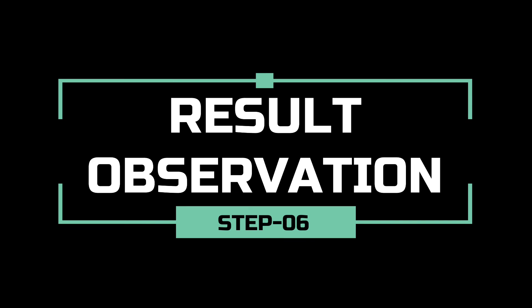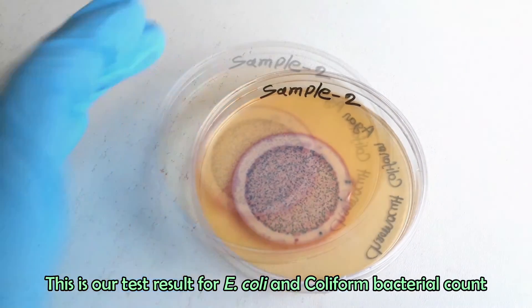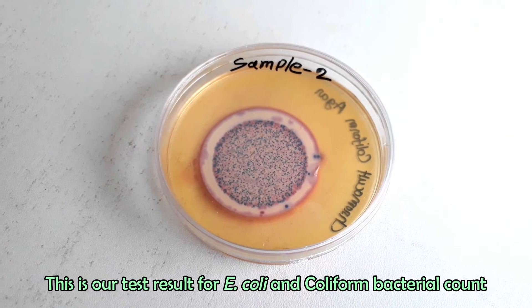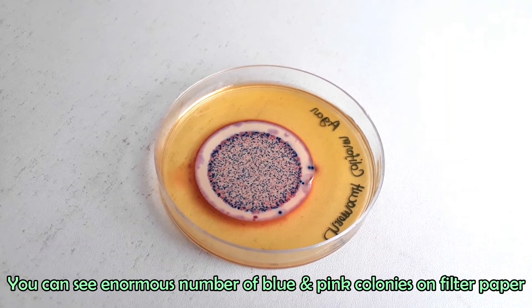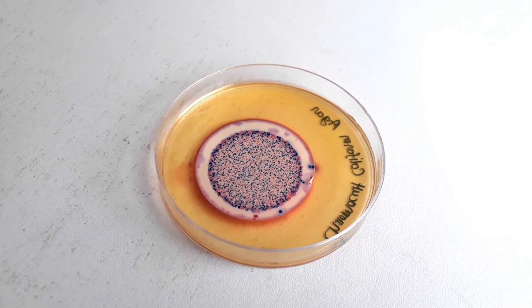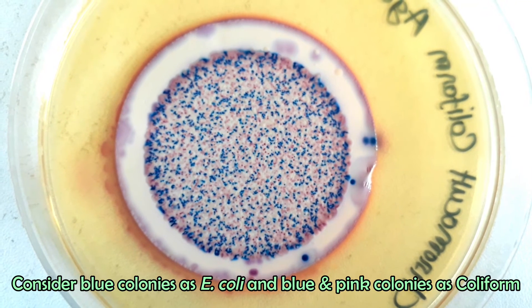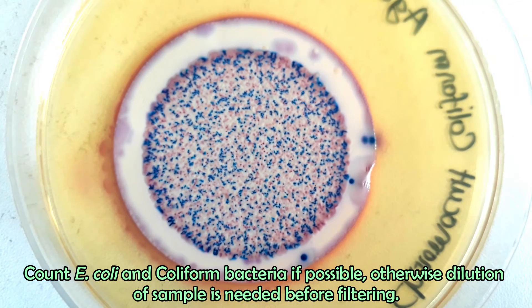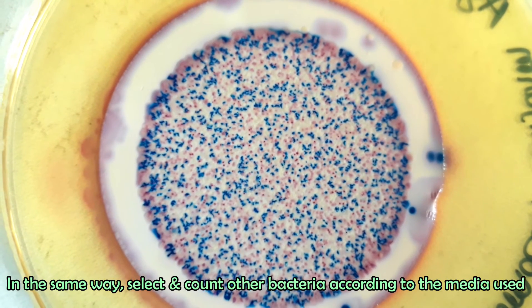It's time for result observation. This is our test result for E. coli and coliform bacteria count. You can see an enormous number of blue and pink colonies on the filter paper. Consider only blue colonies as E. coli and total blue and pink colonies as coliform. Count E. coli and coliform bacteria if possible; otherwise, dilution of the sample is needed before filtering.